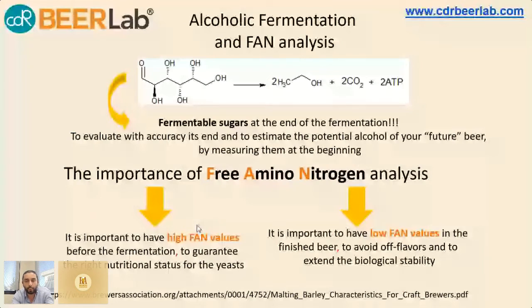So with this analysis, you can find the best compromise between the high free amino nitrogen level before the fermentation and the low free amino nitrogen level in your finished beer. So we are talking about analyzing the amino nitrogen in the wort before the fermentation and in the finished beer. You can do it in the same way with the BeerLab.